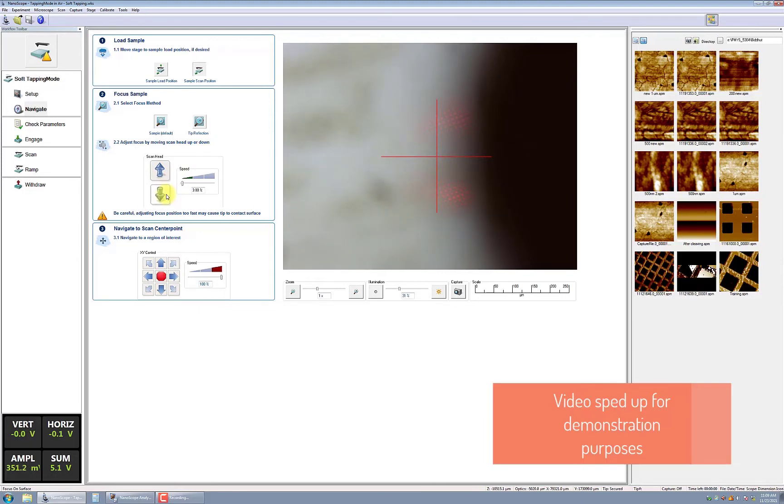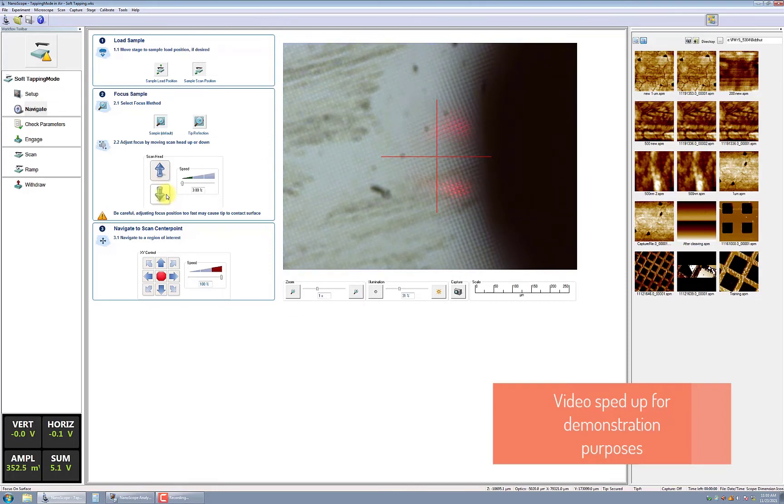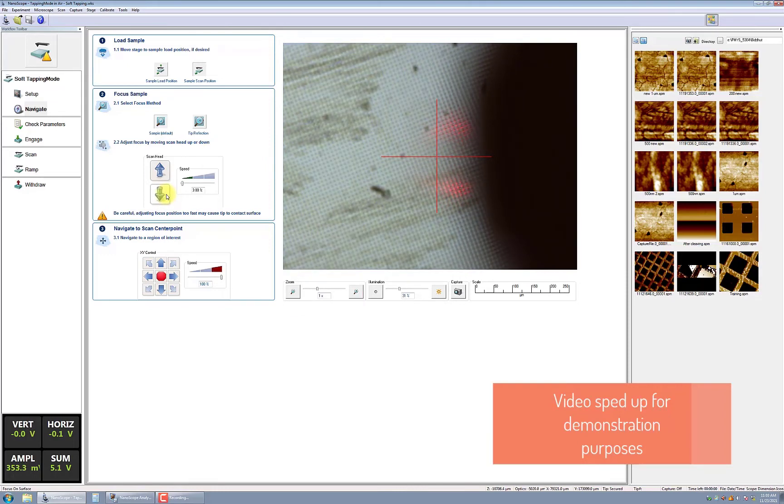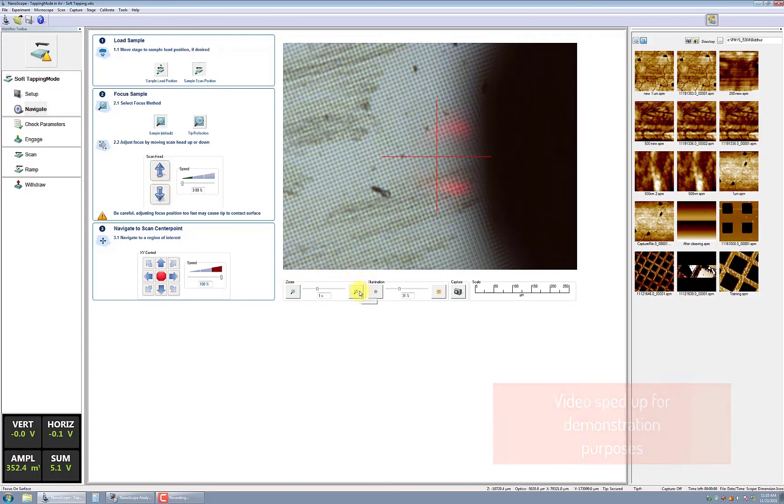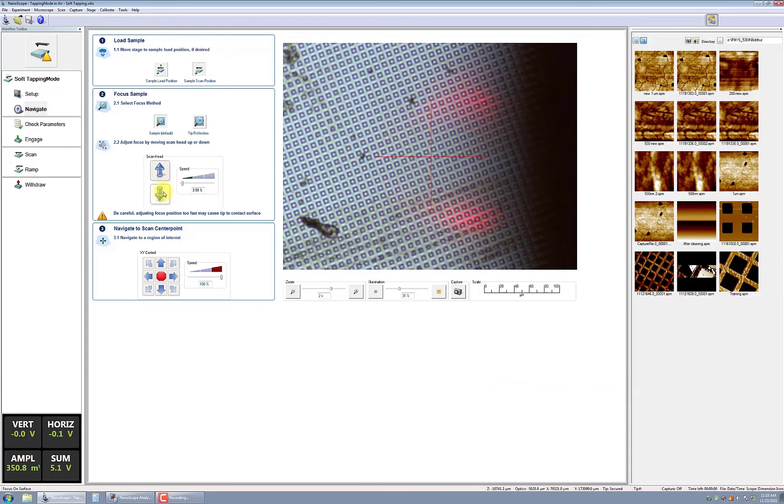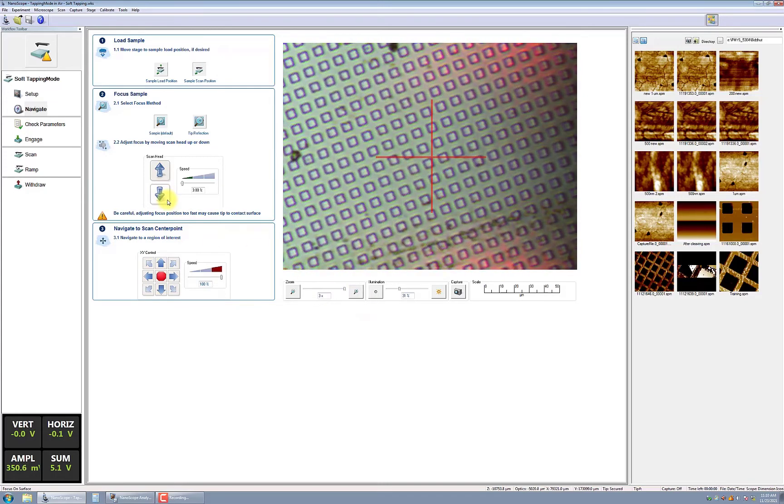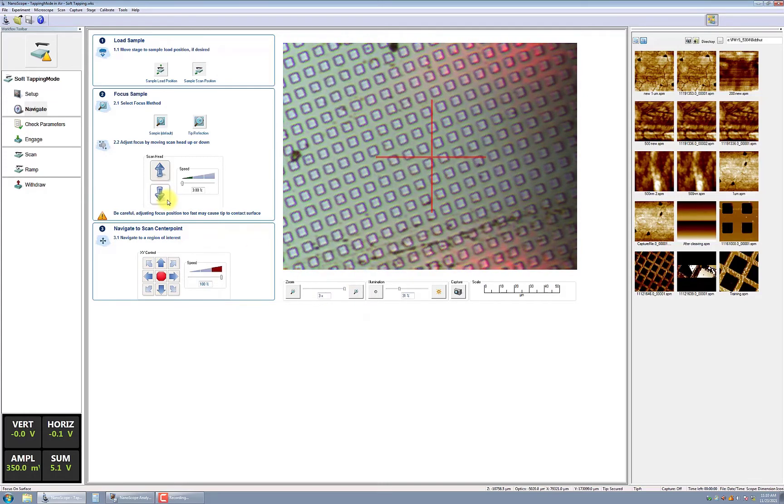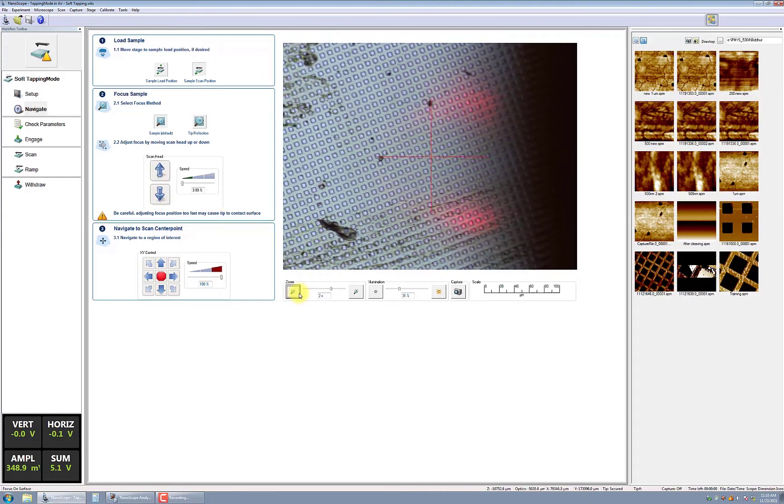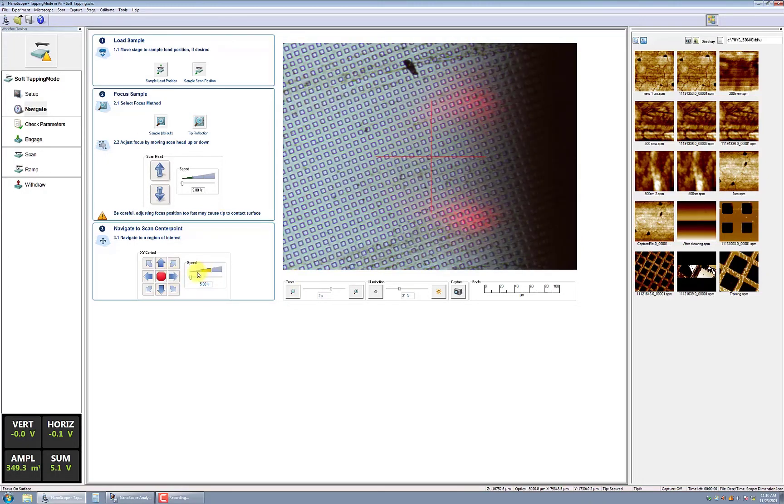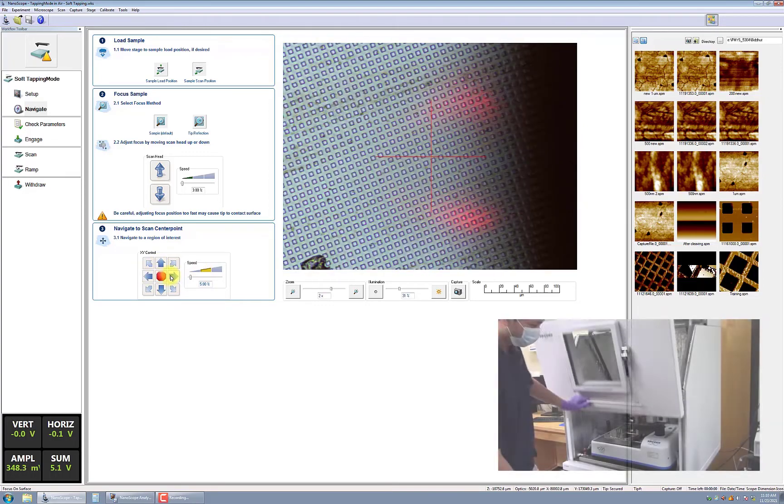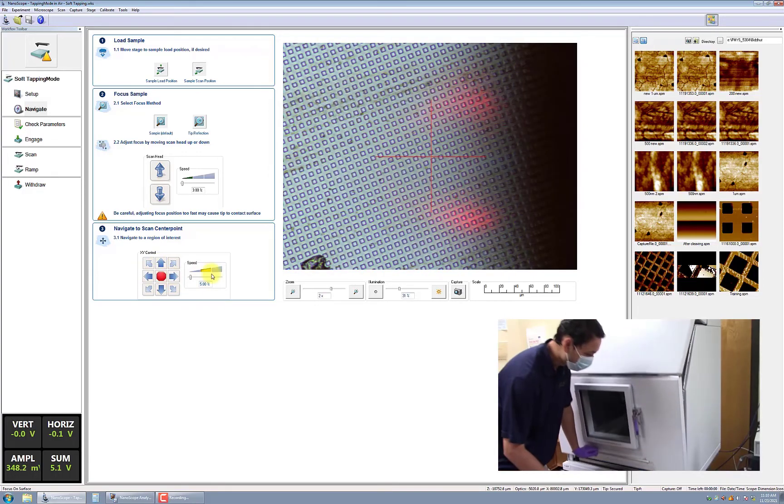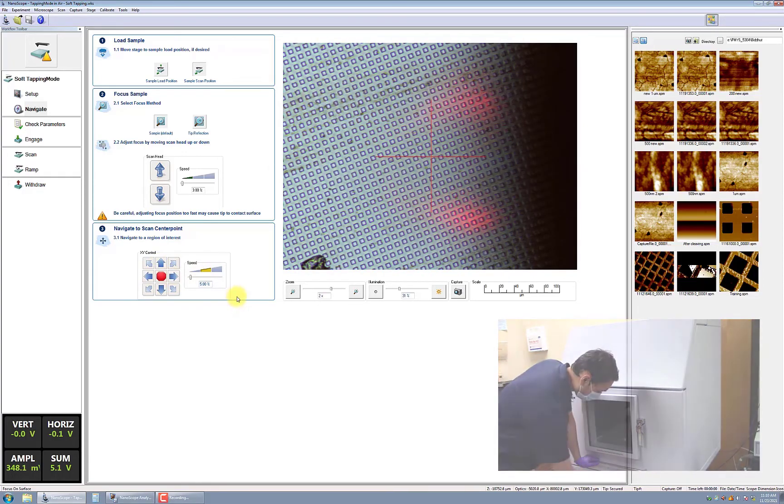Once you have selected the focus method, adjust the magnification to 1x or less. Move the scan head down towards the sample until the sample features come into focus. You should leave at least one millimeter gap between the sample and the probe tip. Then, increase the magnification and refine the focus. Once in focus, navigate to the area of interest on your sample and close the AFM door.